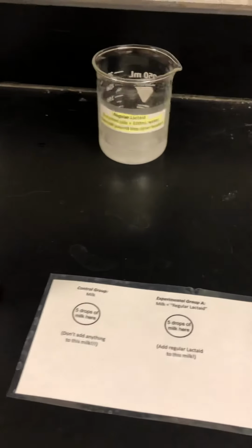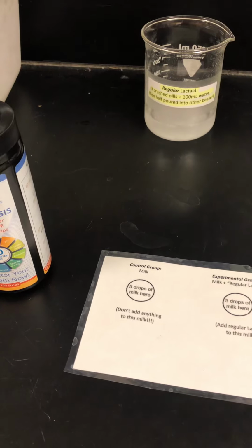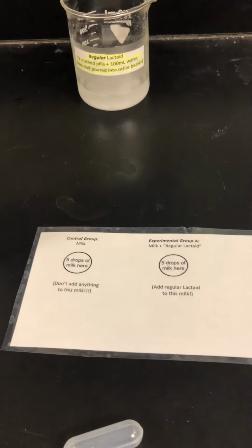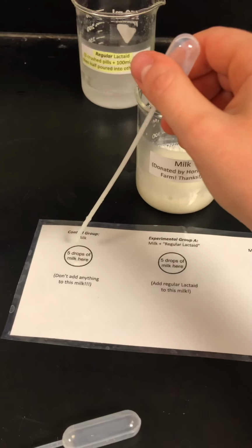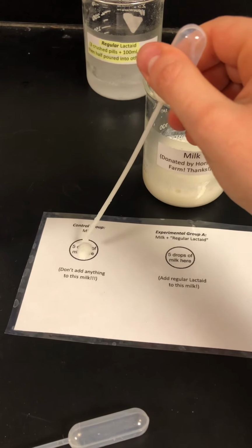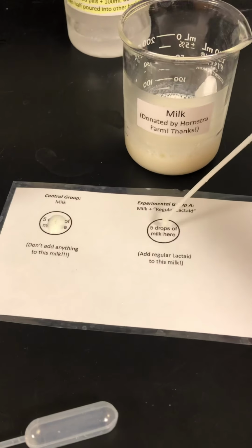So here's my mat. And what I'm going to do is just put 5 drops of milk in each of my little sample puddles. Doesn't have to be 5, it can be 6, but you know, the same amount in each one.